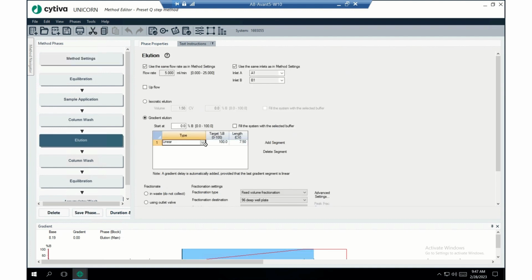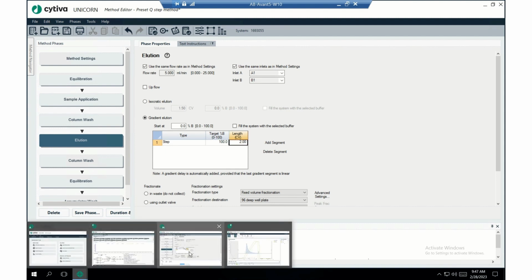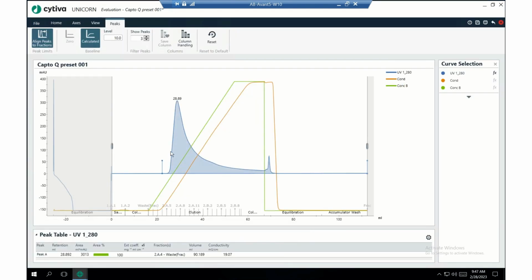All right, so for the elution, we're going to do a step gradient. And I don't really know what steps to do. So first thing we're going to do is change this to step. All right, and then we'll just make each length 2 CVs, right? Which probably wouldn't be enough normally, but we'll go to the evaluation.